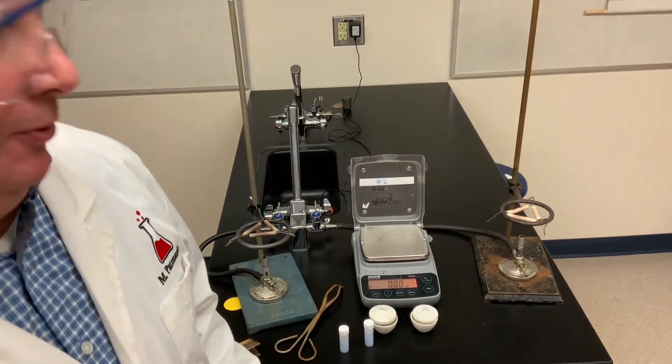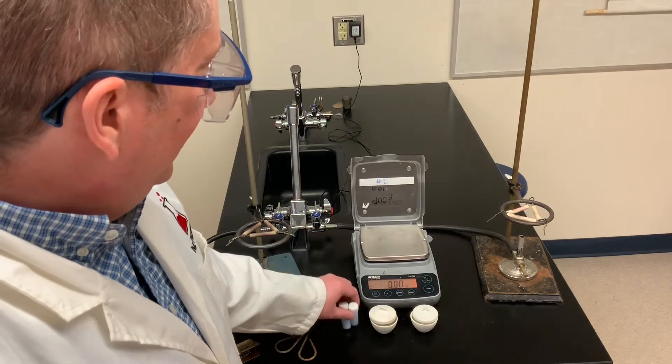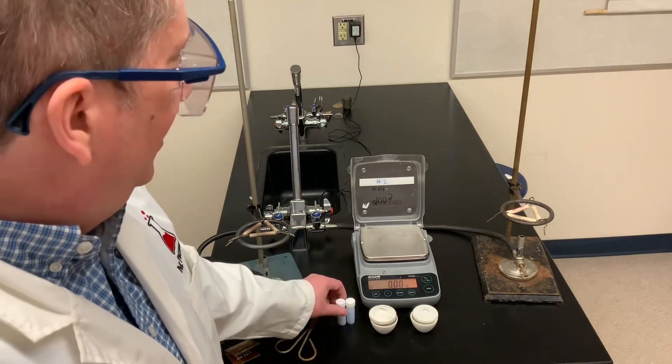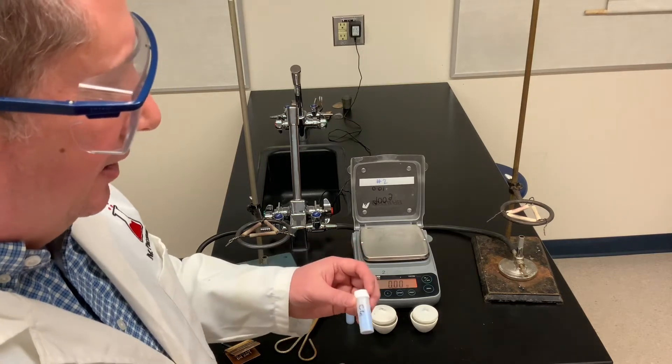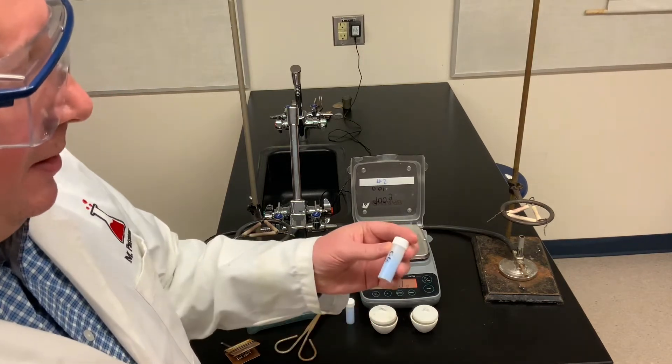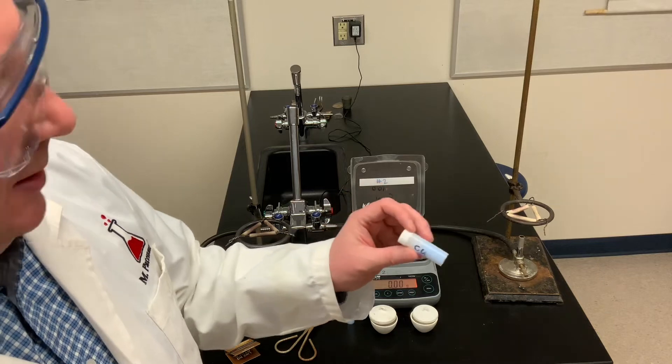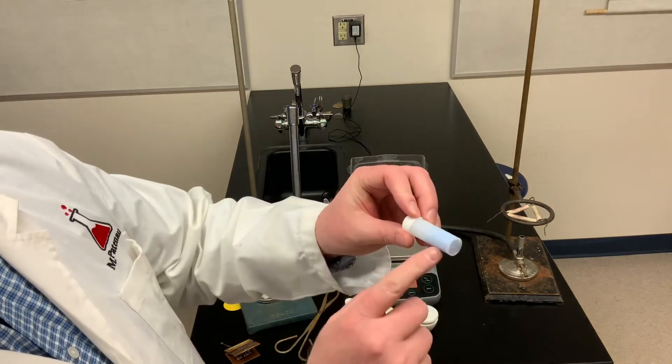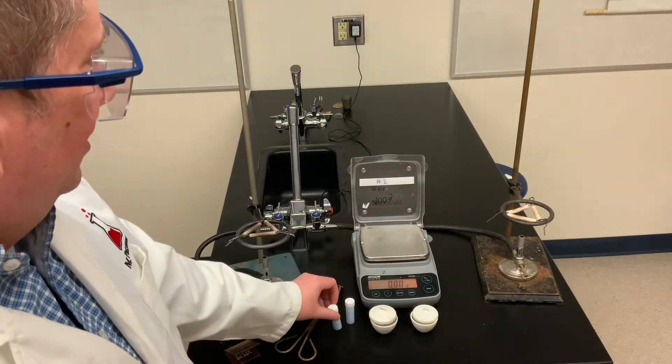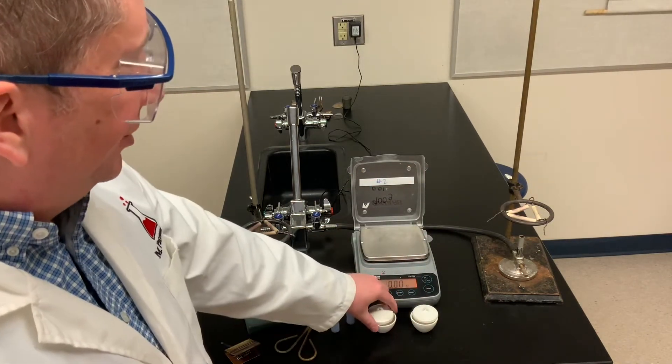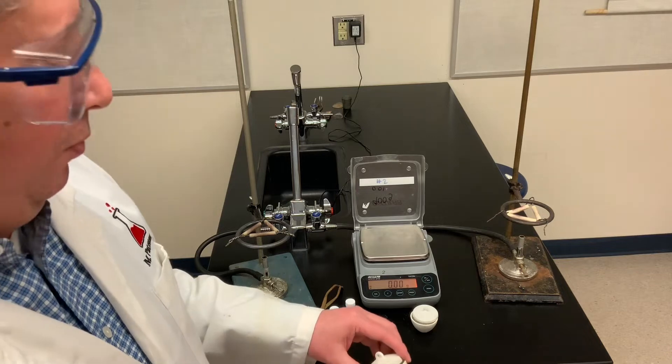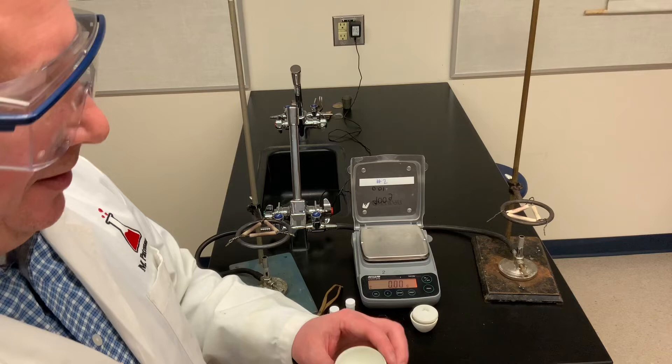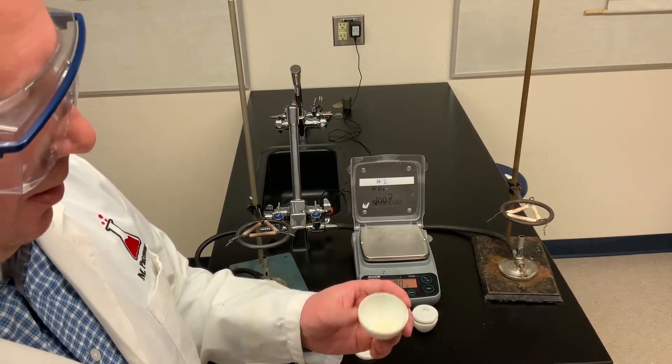Welcome to another laboratory video for chemistry. We're going to be determining the percentage of water in a hydrated ionic compound today. We're going to be using a pretty common hydrated salt of copper sulfate, copper 2 sulfate. It's a blue colored salt. We're going to be heating that salt to drive off the water of hydration that's in the salt crystals and we'll be left with anhydrous salt once the water is gone.